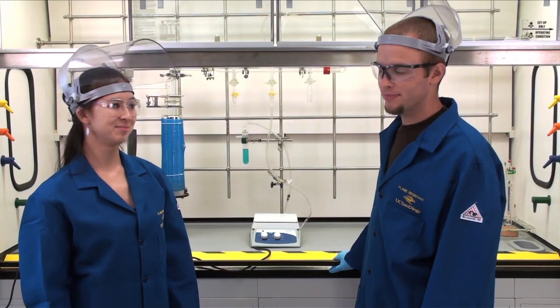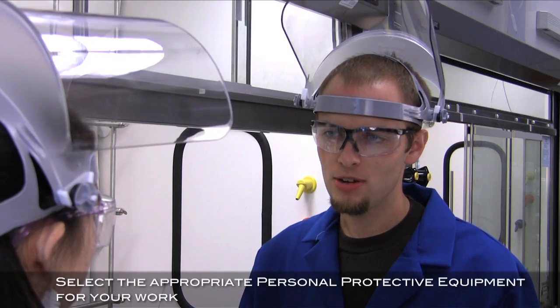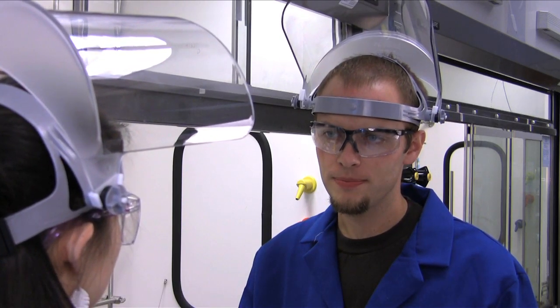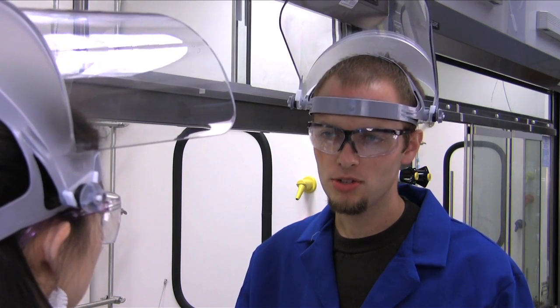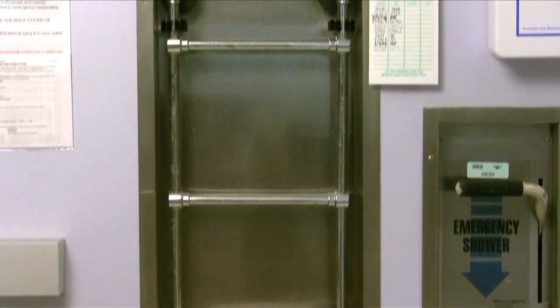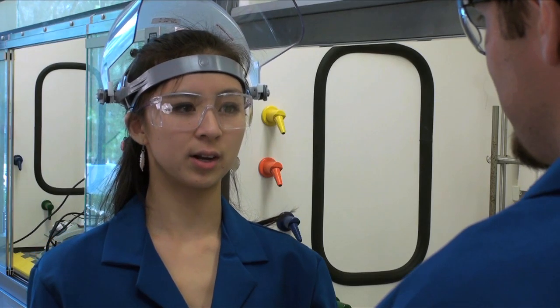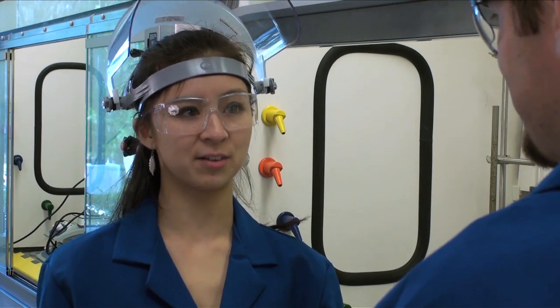That was easy. These lab coats are made of fire-resistant Nomex cloth, and the face shields will protect us when we need to open the sash. Also, we should remind ourselves where the safety shower, the eye wash, and the fire extinguishers are located. I know where those are, but I guess it wouldn't hurt to have a reminder.